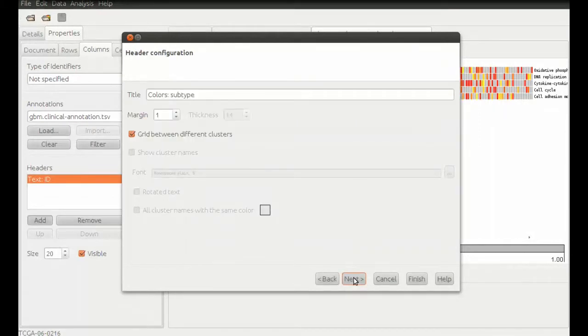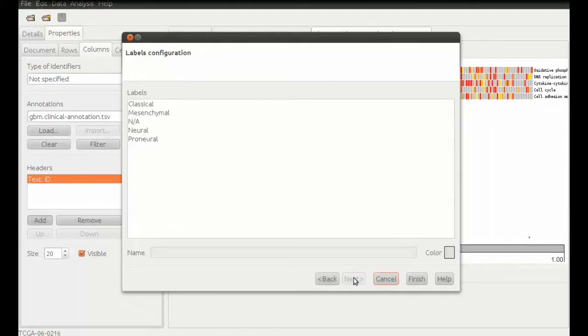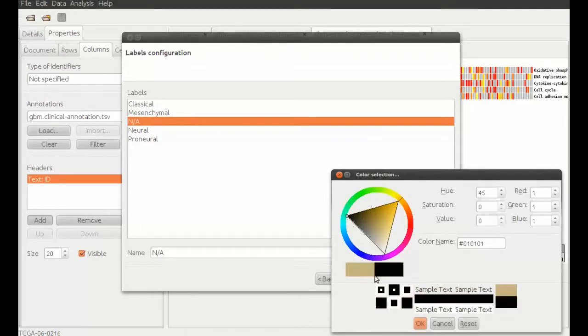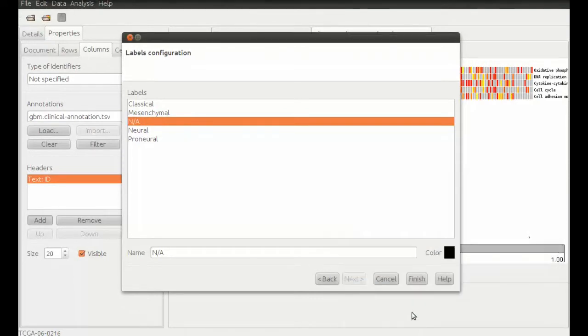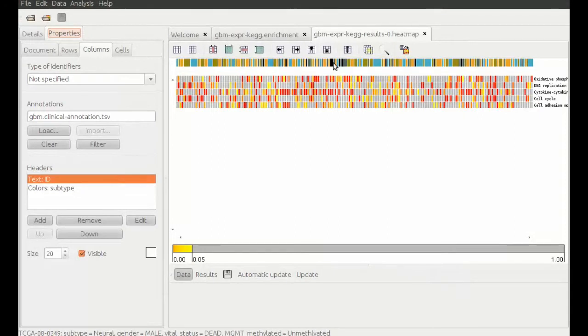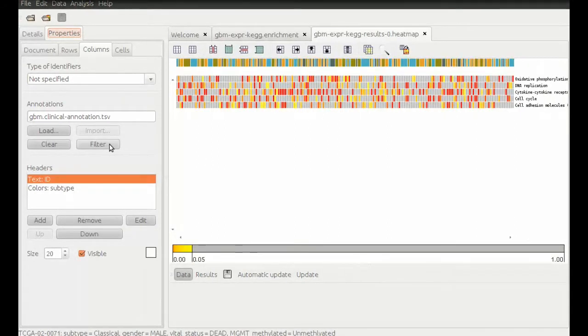The samples for which no annotation was found in the annotation file have assigned NA, not available. They will not be useful to us, so we filter them out.